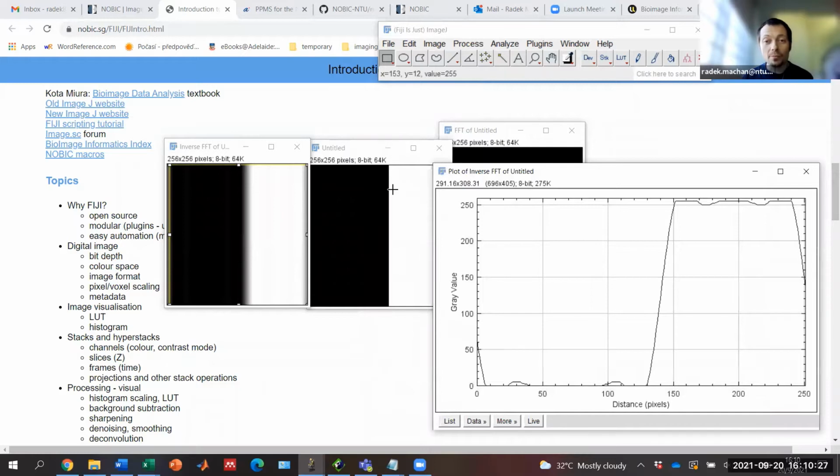And this is what comes from, because I removed the highest frequencies which were needed to describe a steep edge. In principle, you need an infinite series of periodic functions. So if I remove the highest frequencies, I won't be able to describe a very sharp edge. So the edge is blurred, and on top I'm starting to see some periodic modulation.